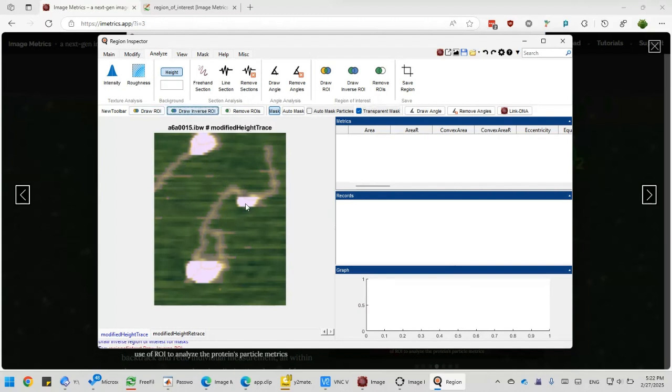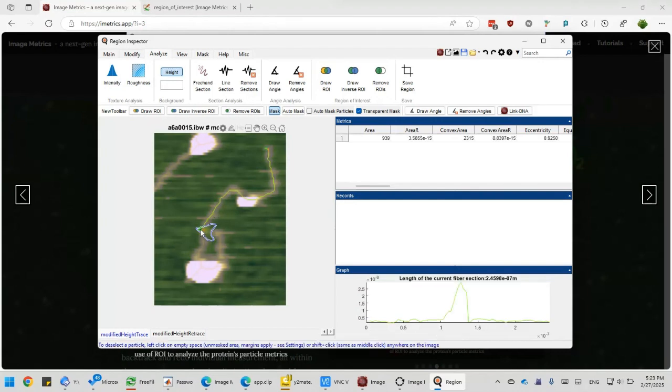Now if I simply draw an inverse region of interest, for example, this DNA here is connected, right? So we don't want that one. We don't want them to be disconnected. And also this protein may not pass this protein complex very well because it kind of bleeds on top. So let's just make it one example. If I'm drawing an inverse region of interest, I did some accidentally. I cut off the DNA, and that's unwanted. Now the DNA is disconnected. You see? I click the DNA molecule, so it's not passing through this block that I put here.